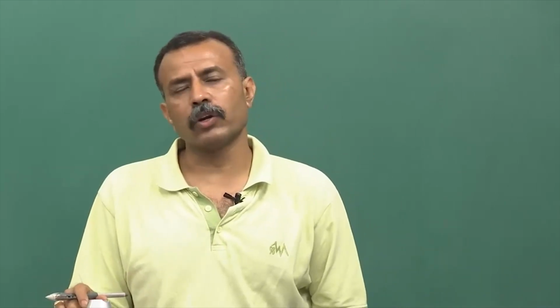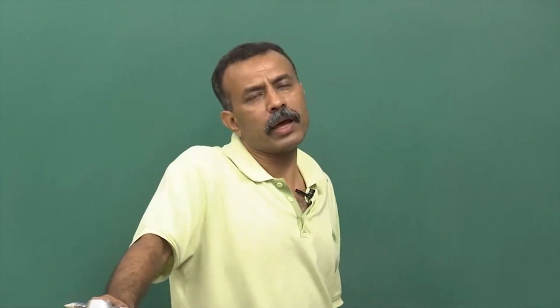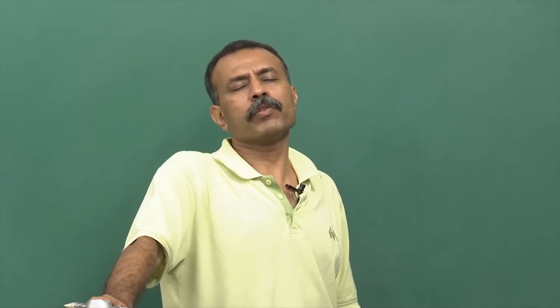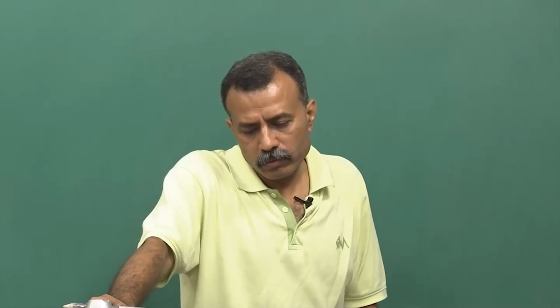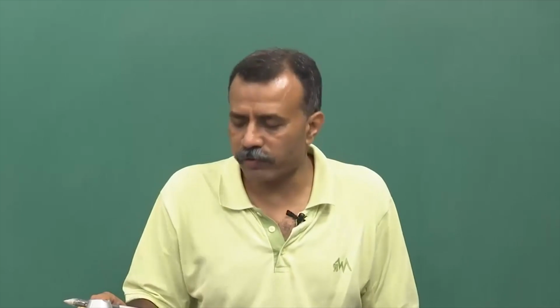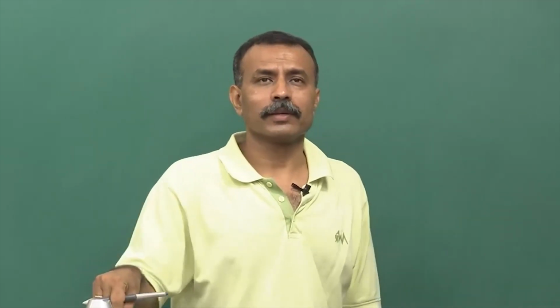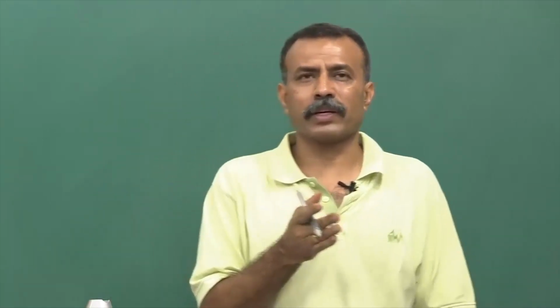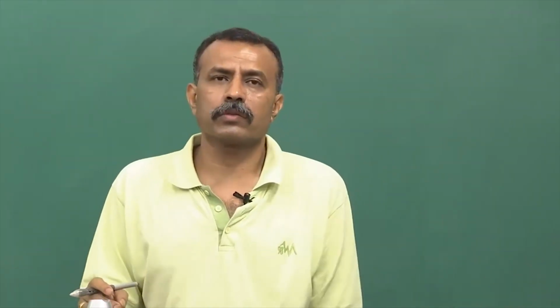These are things which are not being told, but as graduate students or as an independent PI, you have to be cautious. If you are a PI, you have to ensure that your lab staff follows this. If you are a graduate student, it is even more important, because this is your experiment which everybody wants to repeat somewhere in the world, and they should not come across one effect this time and another effect the next time. These small errors can cost very dearly.